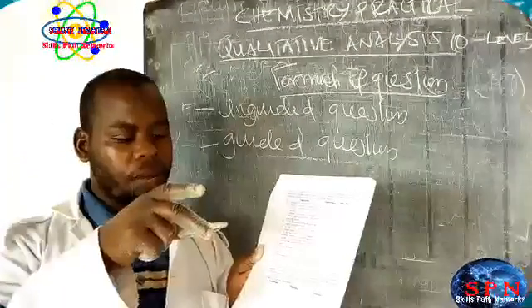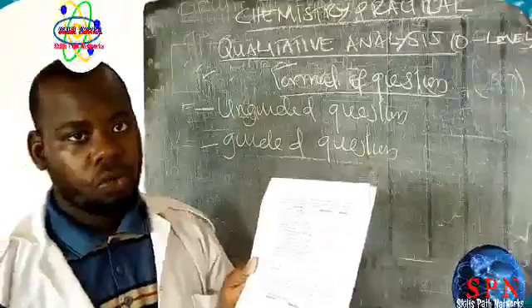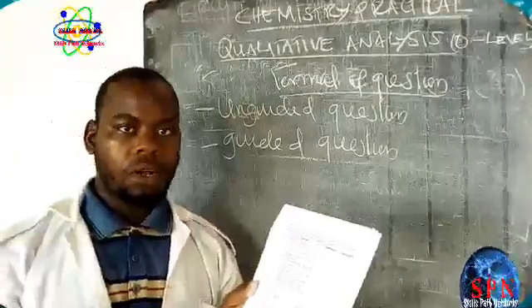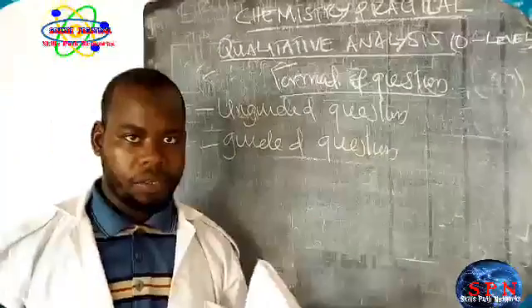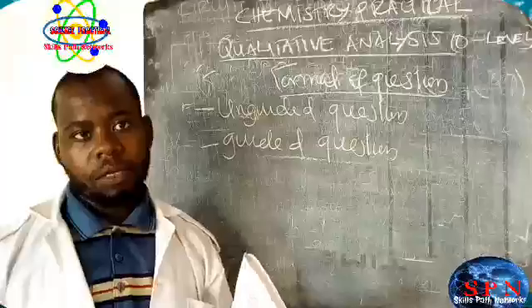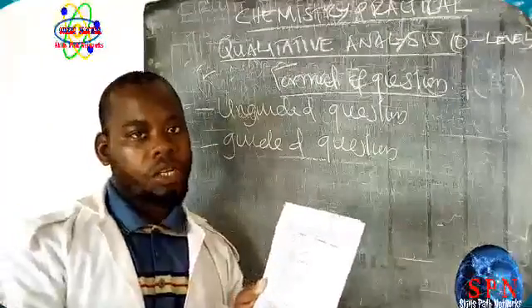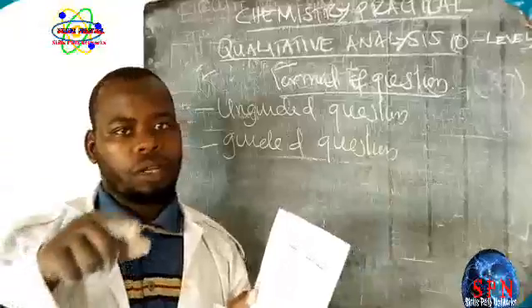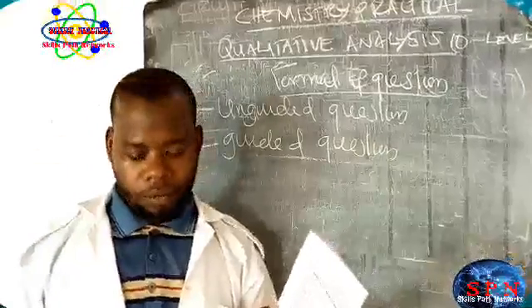After observation, I find the sheet to look, according to this observation, at what to infer in order to write the inference. So it goes from the question paper to the sample to the guide sheet, then you look at your answer sheet to write your answer.